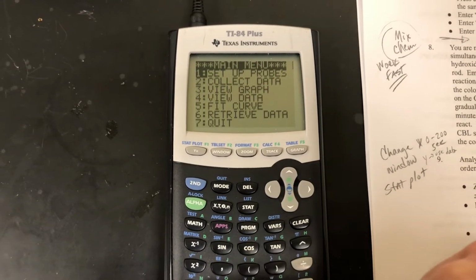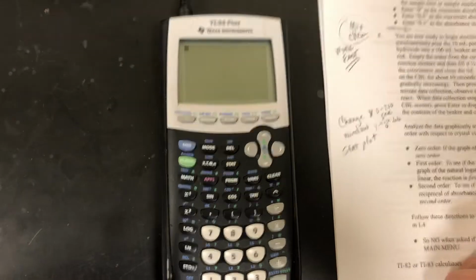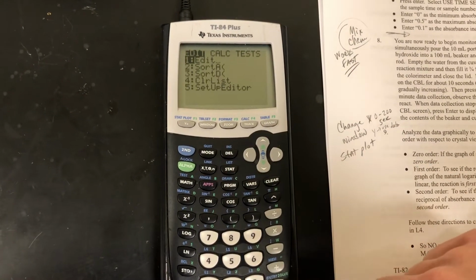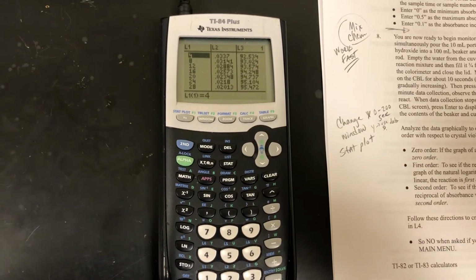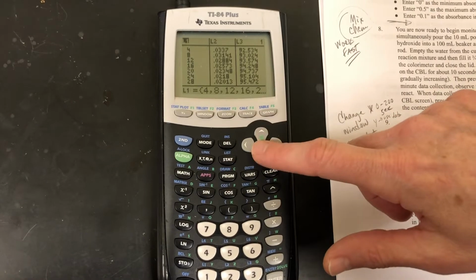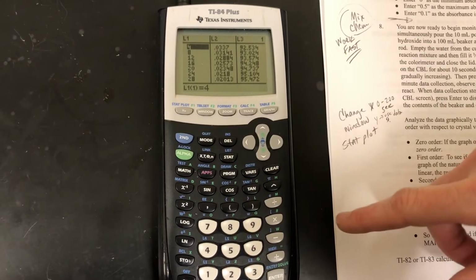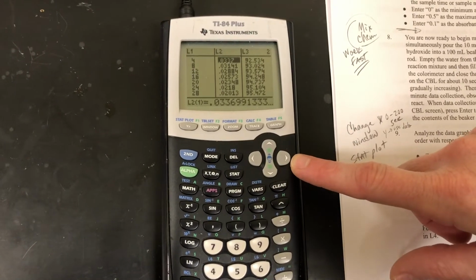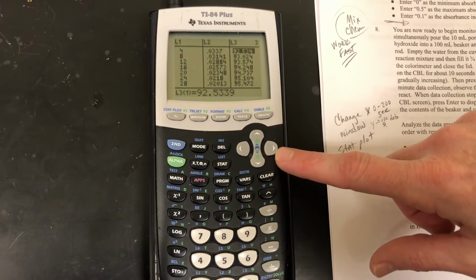So I'm going to actually do 7 and quit out of this ChemBio program. And then I'm going to go to Stat, Edit, and you can see what it's done is the time is in L1, and it should be like 0, 4, 8, 12, all the way up to our 180 seconds. L2 is our absorbance values, and L3 is our transmittance values.